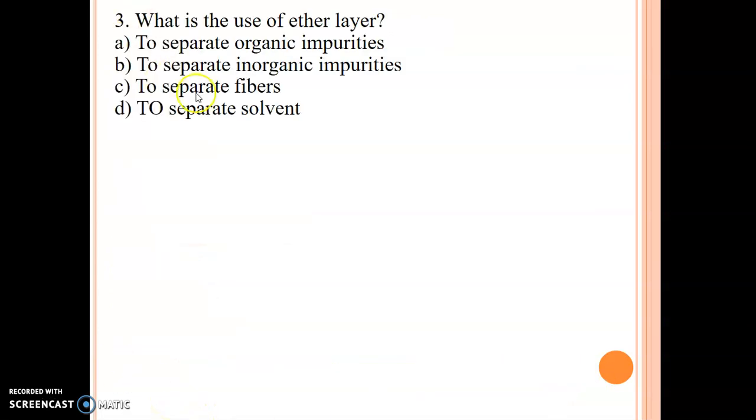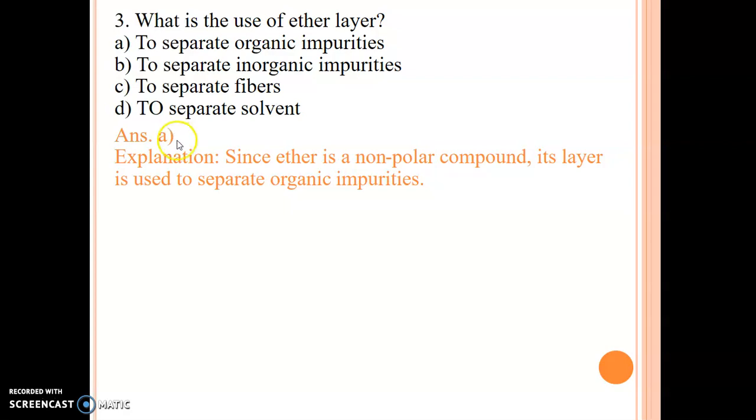Next question is: what is the use of ether layer? Options are to separate the organic impurities, to separate the inorganic impurities, to separate the fibers or to separate the solvent. And right answer is option A. Since ether is a non-polar compound, its layer is used to separate the organic impurity.